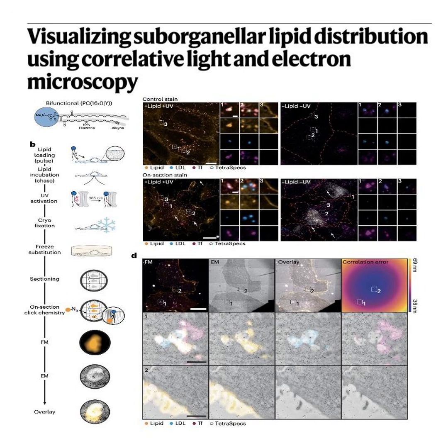Now, historically, you could bypass that movement problem by flash freezing the cell. Oh, right, cryopreservation. Yeah, which preserves the physical structure beautifully. But here's the catch. To know which lipid was which, after you froze it, you still had to attach those bulky fluorescent tags to the live cell first. Ah, so you still ruin the natural behavior before you freeze it. Exactly. You trade unhindered behavior for structural visibility. It's a lose-lose.